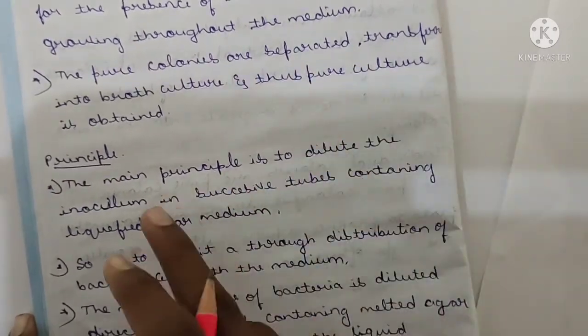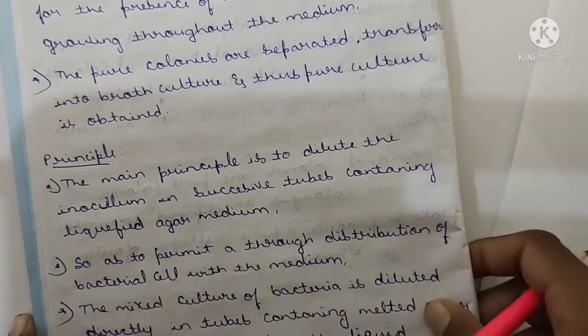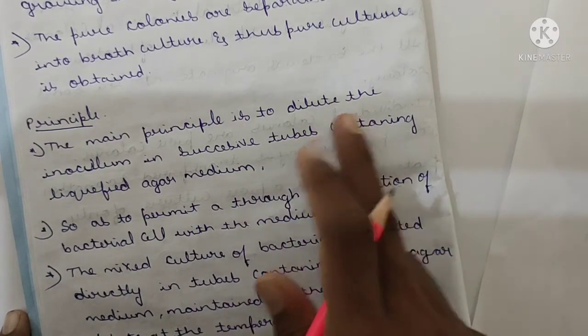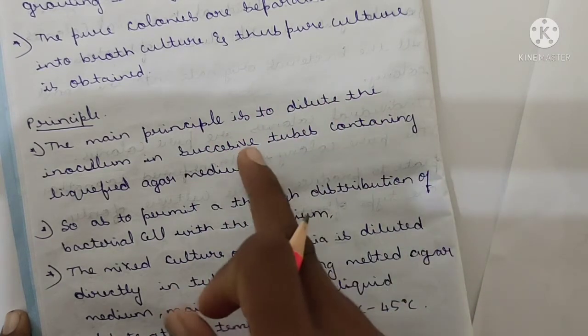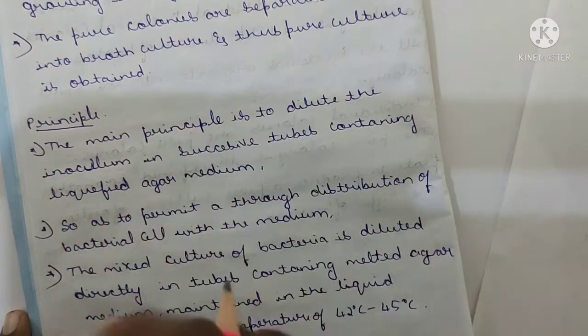See, the main principle is to dilute the inoculum in successive tubes containing liquefied agar medium. The main principle is to dilute the inoculum. Inoculum means that mixed microorganism. We have to dilute that in tubes containing liquid agar medium.